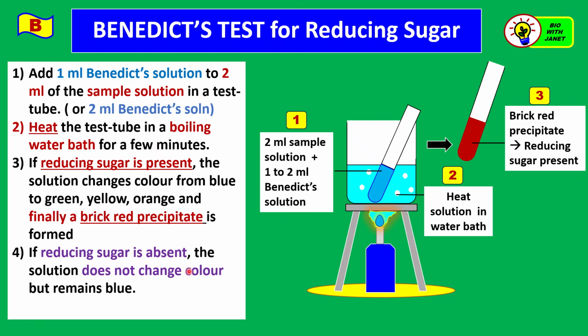Okay, but if reducing sugar is absent, the solution does not change color at all, it will remain blue. Don't write does not change color, just write blue.